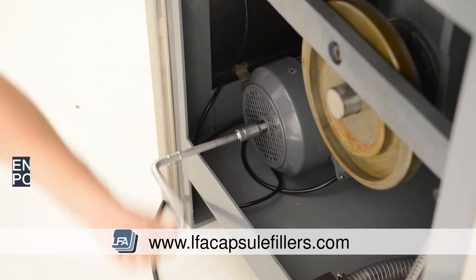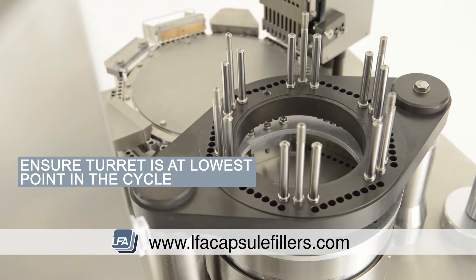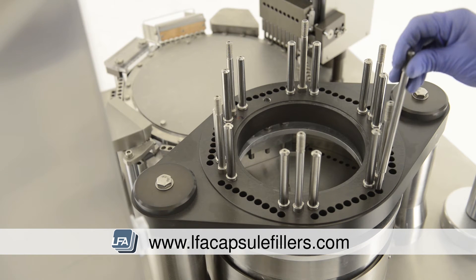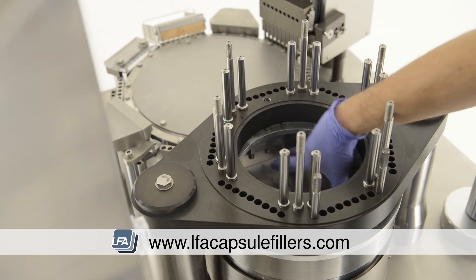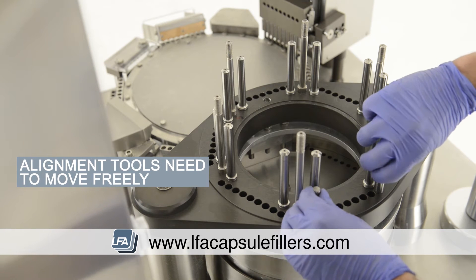Now we rotate the machine by hand so the tamping turret is at its lowest point in the cycle. Take your alignment tools and place them at either end of the station. Now adjust the bottom section until the alignment tools fall into place. Ensure the alignment tools are loose and able to move freely.